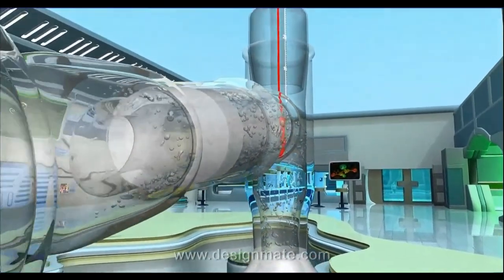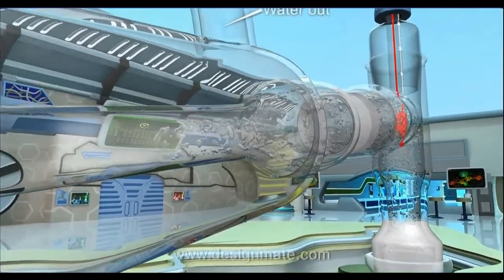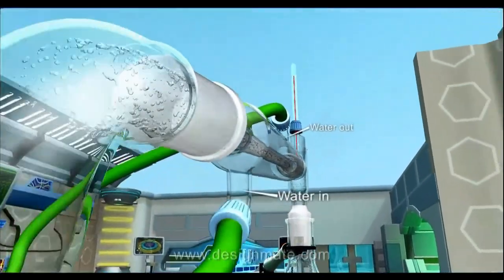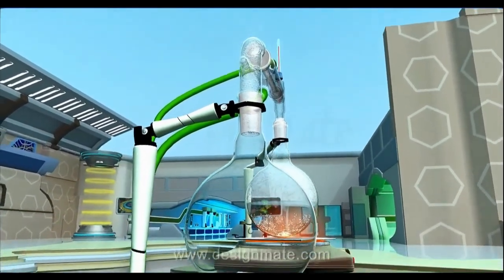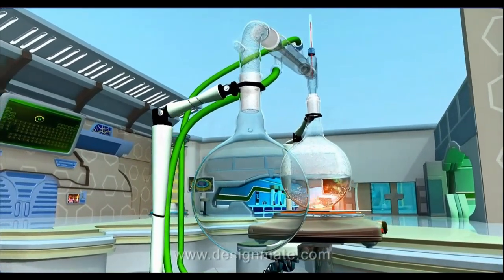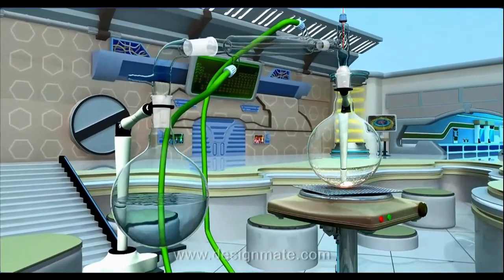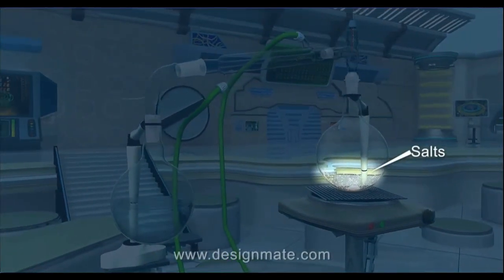The vapor enters the inner tube of the condenser, where it slowly cools and condenses back into droplets of pure water. This pure water is then collected in the receiving flask. When almost all of the water has been collected in the receiver, switch off the heater. This white stuff, which remains in the boiling flask, is actually the salts which were present in the seawater.